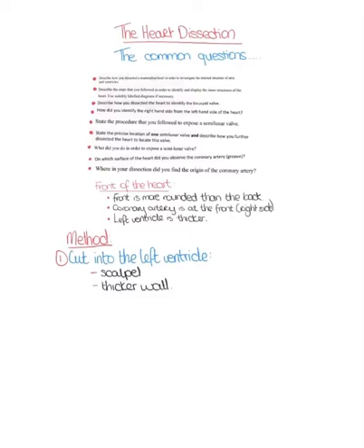The next thing you would do is cut into the left atrium, and you'd see that this is clearly a lot smaller than the left ventricle.